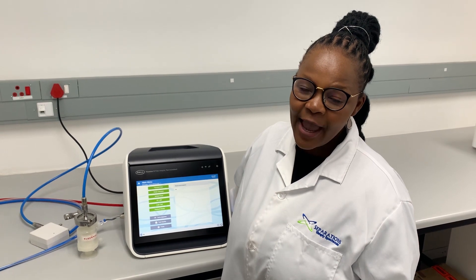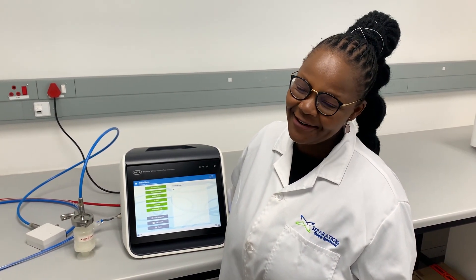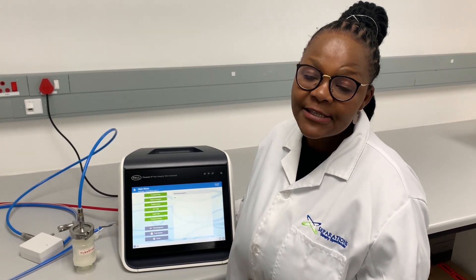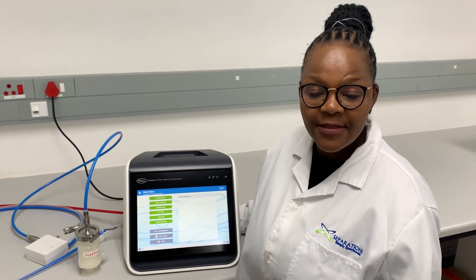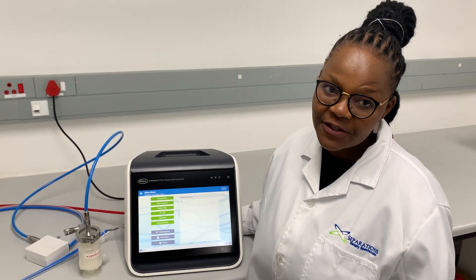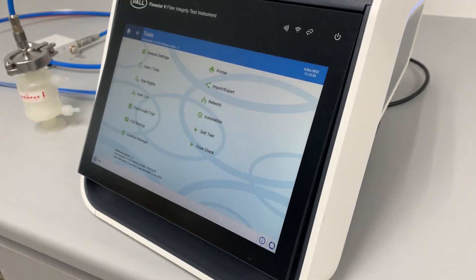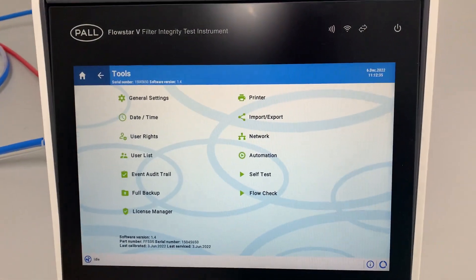It ensures accurate filter integrity testing with full compliance to 21 CFR Part 11. It features advanced automation capabilities and simplified network integration, saving the user time while improving process efficiency. It has been developed and validated in accordance with GAMP 5, and the system features an IP54 rating.